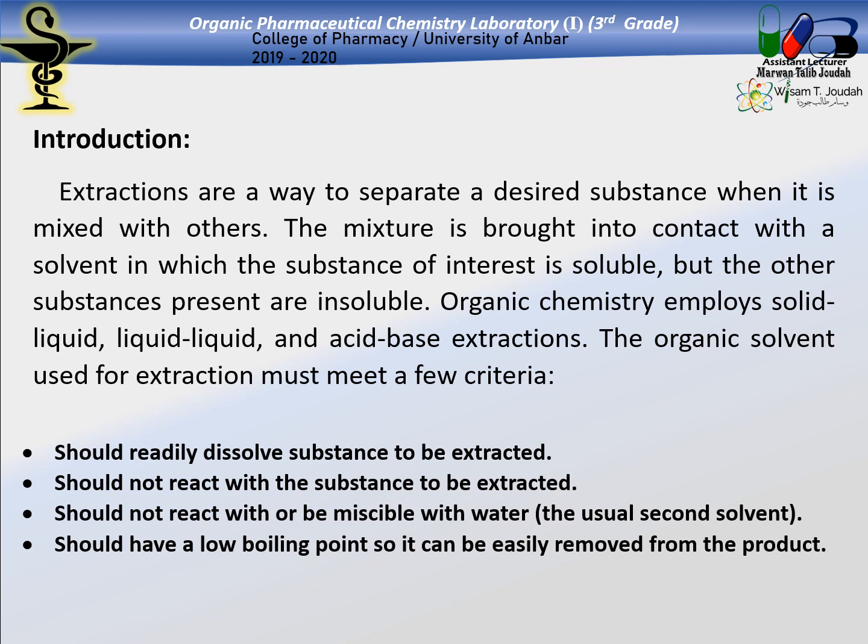هنا لازم استخدم solvent, and that solvent must get the aspirin, the acetylsalicylic acid, completely dissolved in it. الاديتيفز والبايندرز لازم تكون insoluble من هو السولفنت اللي استخدمته. Therefore I will be able to get them separated or extract them.